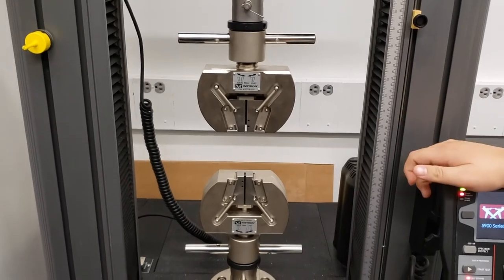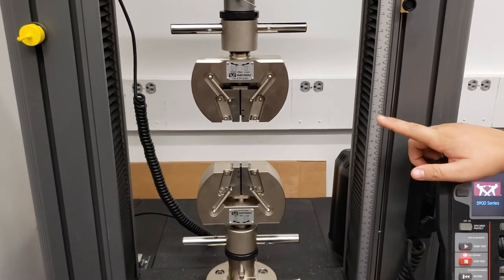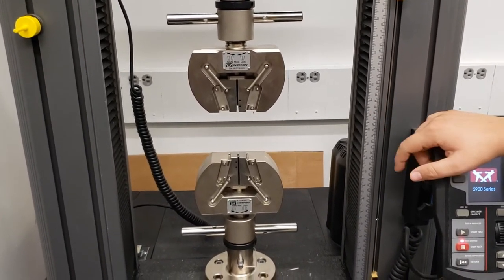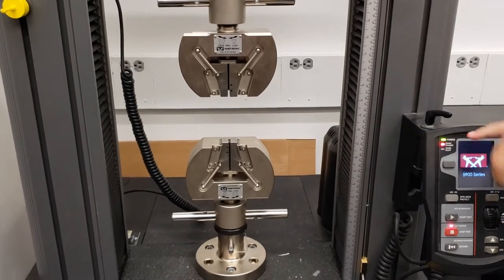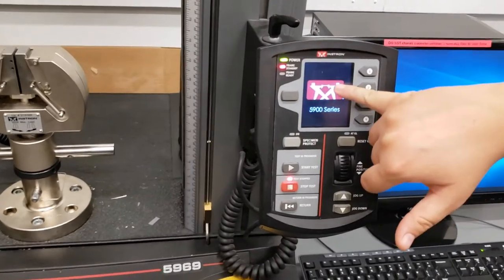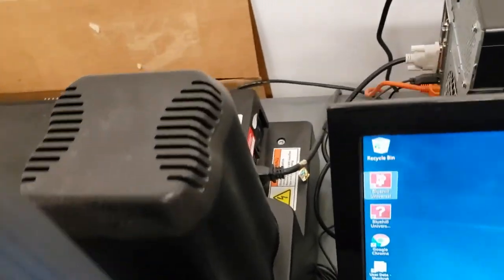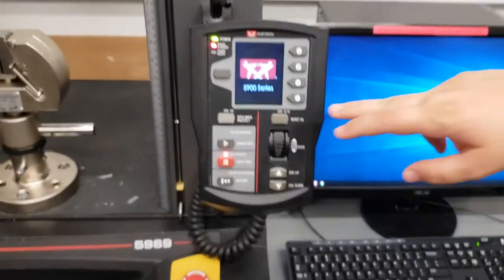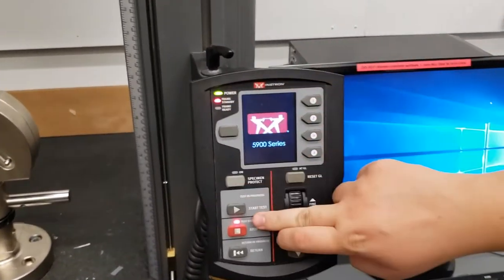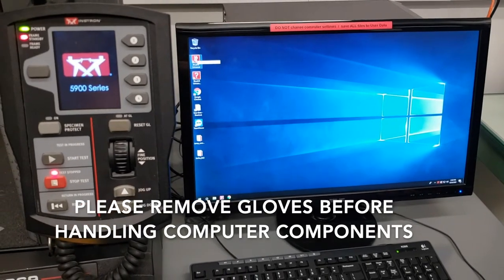Once we've got our two attachments together, we're first going to double-check that the machine is turned on — you can see we've got a green light, so the machine is on. If you need to turn on the machine, the power button is right behind the computer tower toward the back corner. Once this window and these lights are stable, I'm going to come over to the computer and turn on the software just to give us power to the instrument to move it around.